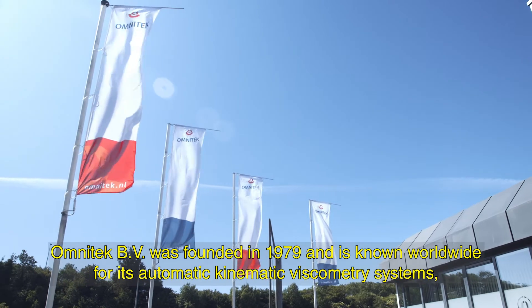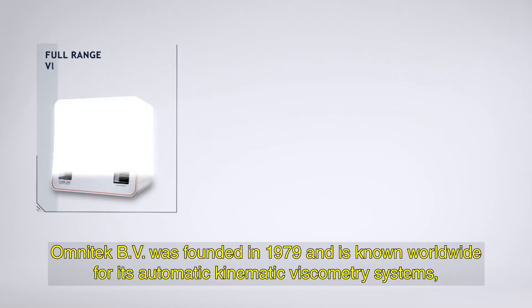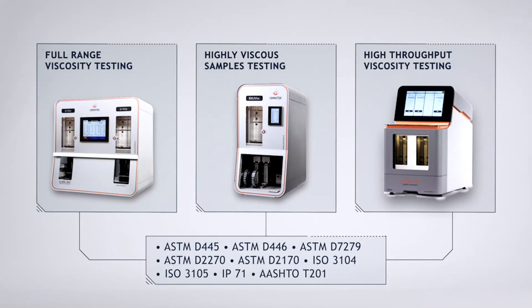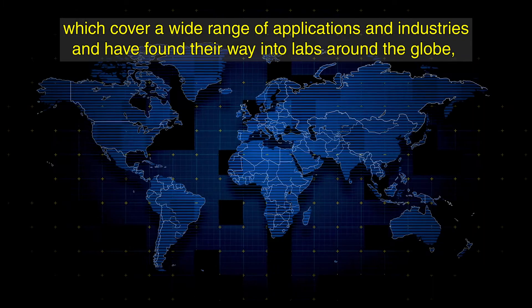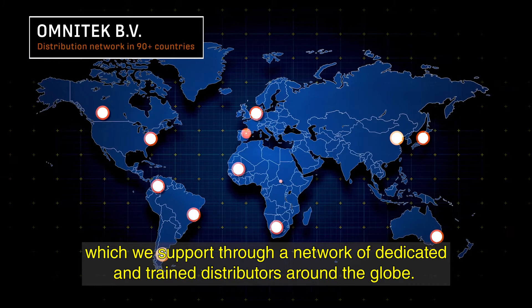Omnitek B.V. was founded in 1979 and is known worldwide for its automatic kinematic viscometry systems, which cover a wide range of applications and industries and have found their way into labs around the globe, which we support through a network of dedicated and trained distributors.